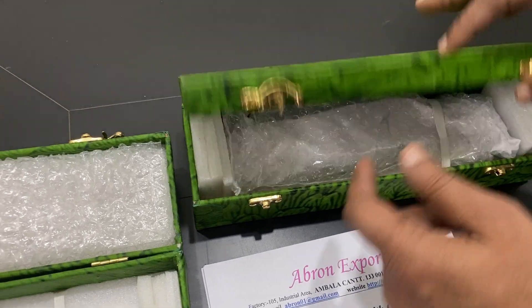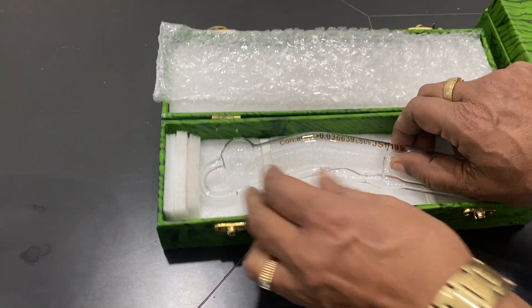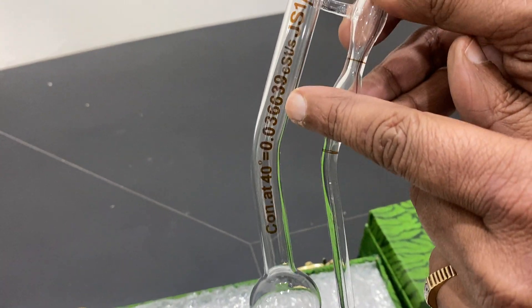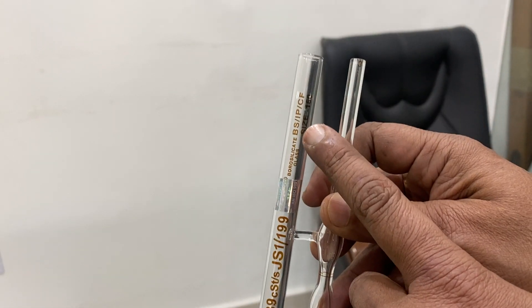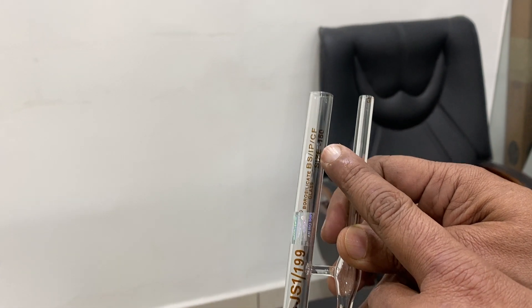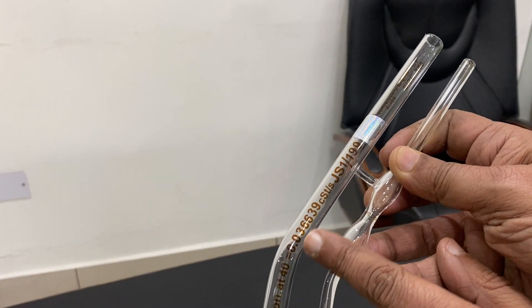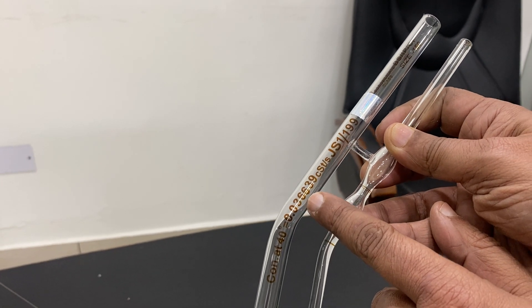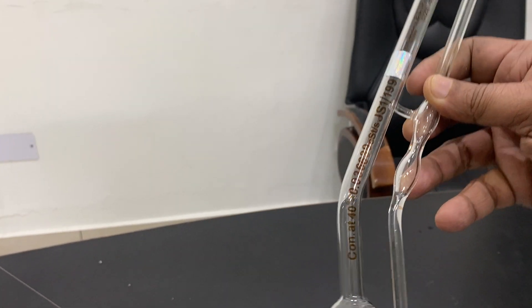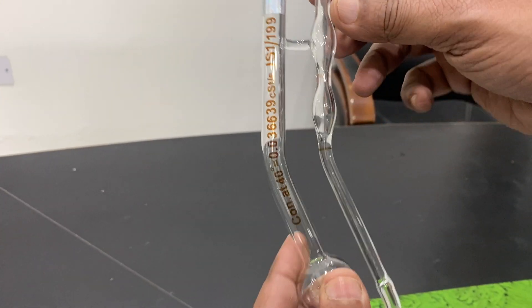The viscometer comes completely packed. These are calibrated at 40 degrees. I can show you the serial number — this is size 150mm — and the accuracy constant, which is 0.036639 CST per second. This constant has been verified for this particular model.